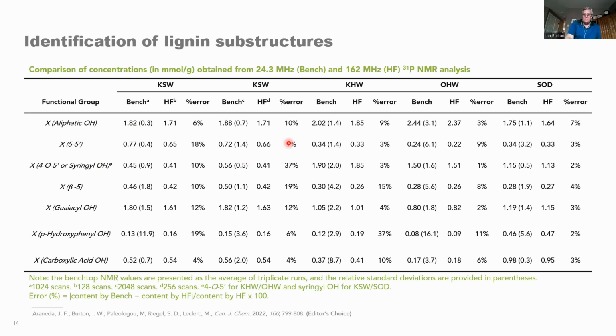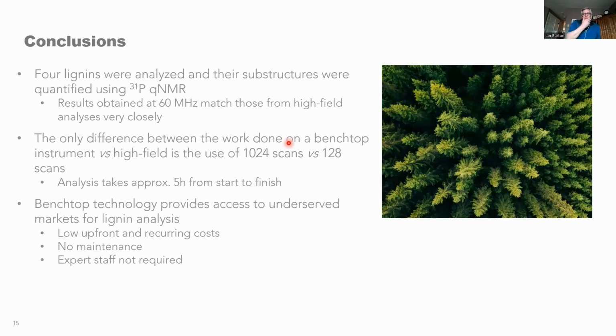And so, just in conclusion, I'll leave some room for questions. Four lignins were analyzed. The four different standard lignins.